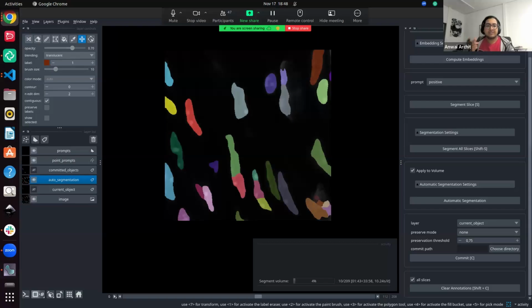But if you see, the keyword is better, it's not doing as good of a job if you literally, let's say, retrain the model of all and update all the parameters. But if you become selective, it's a bit tricky. There are some gains which you have, but on a higher level, there's no clear outcome. It is a very data dependent question.